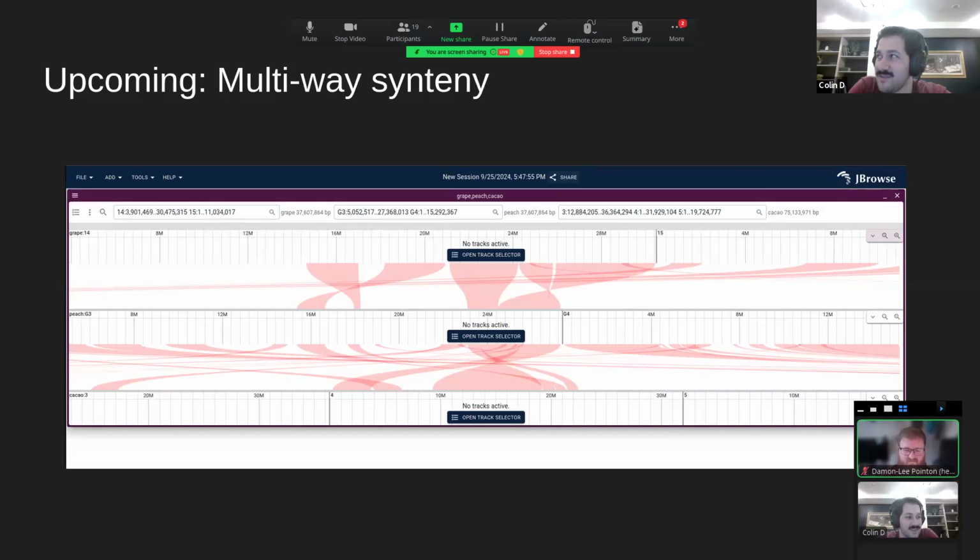I think this is a good first step, though. We created the primitive, you might think of it, of just doing this series of pairwise comparisons.